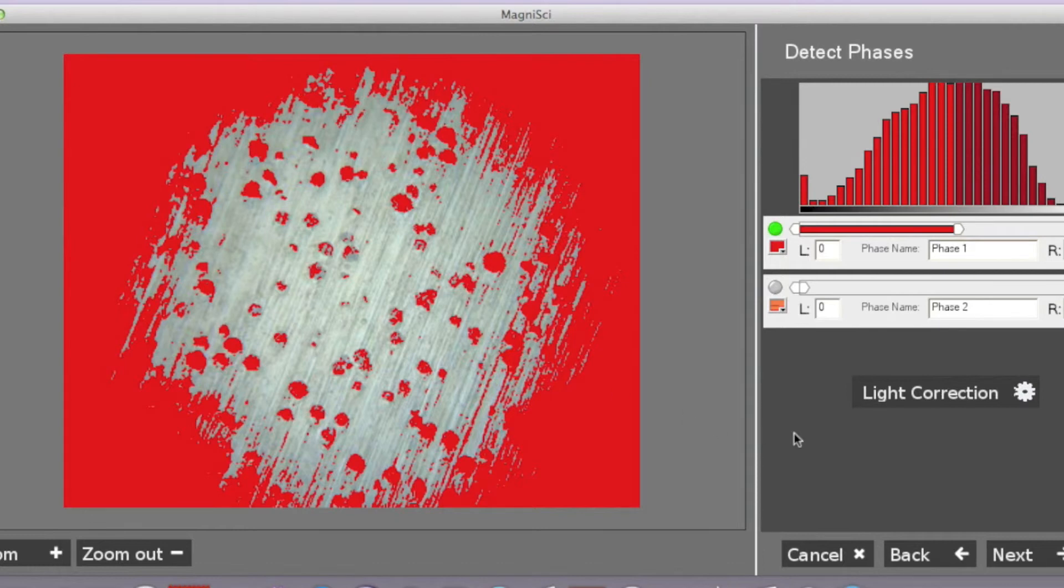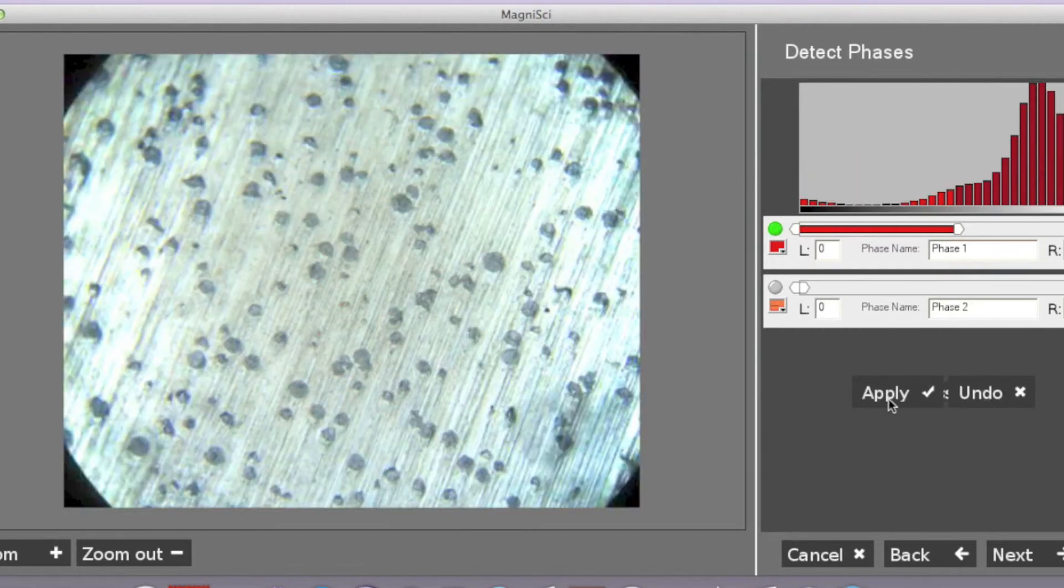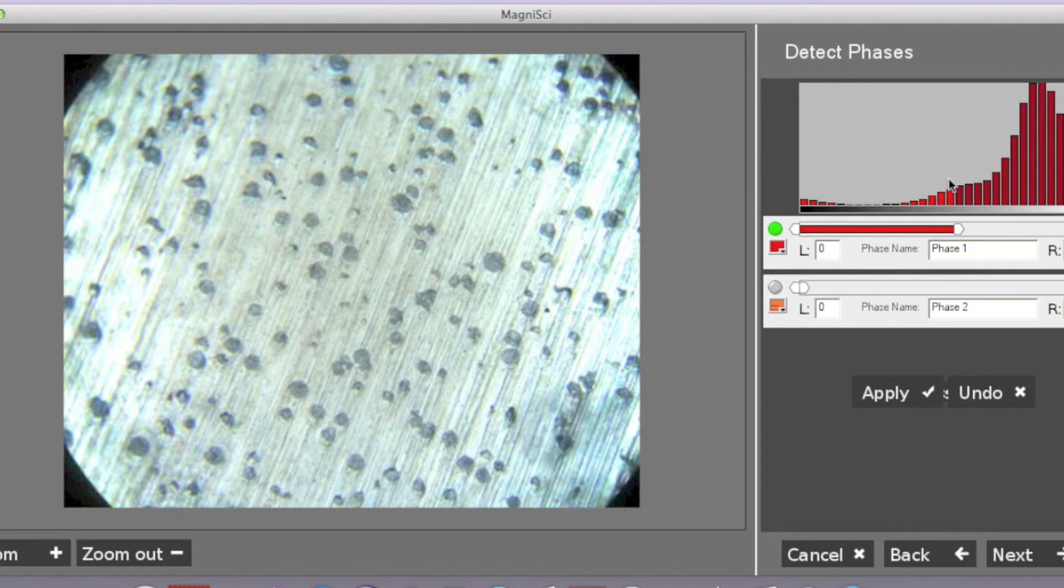To fix this, we will click on light correction. And there we have it. As we can see here, the distribution of color is now a lot more one-sided.